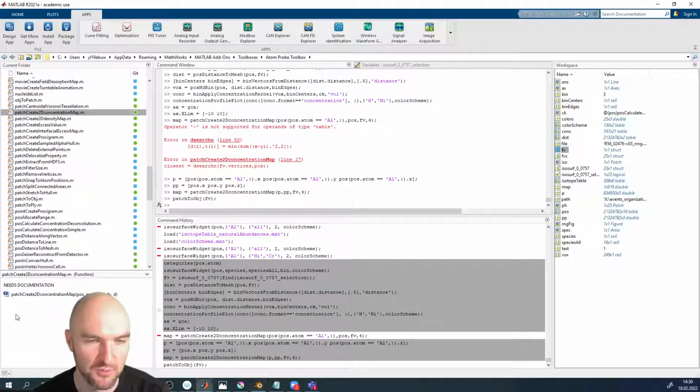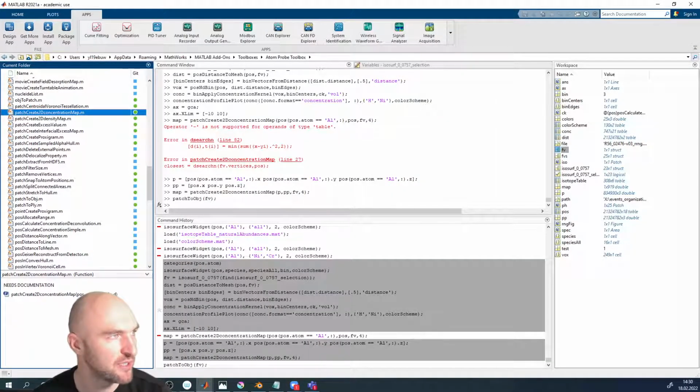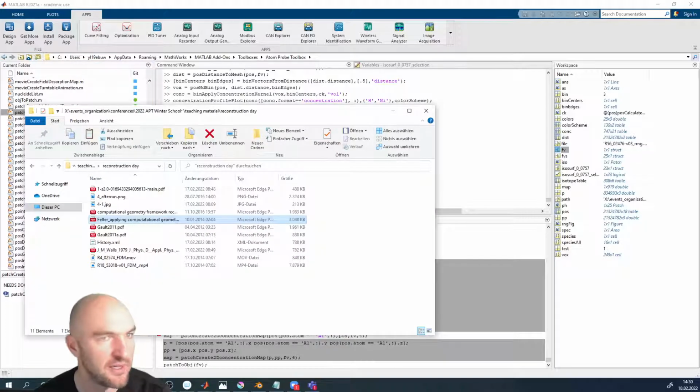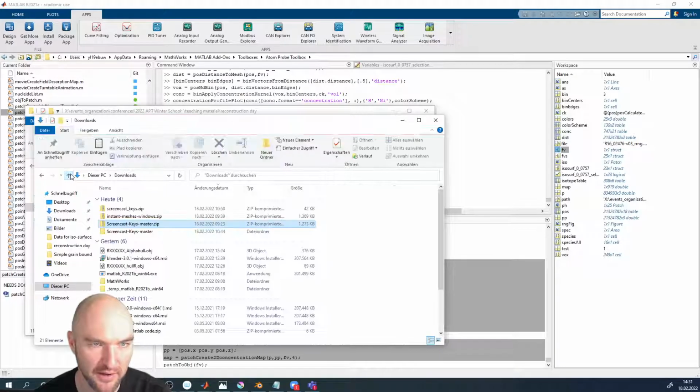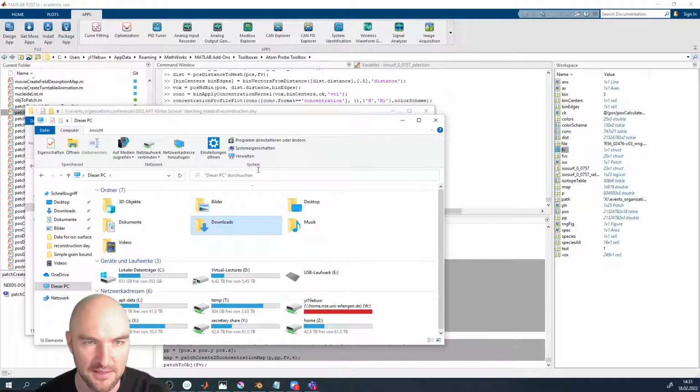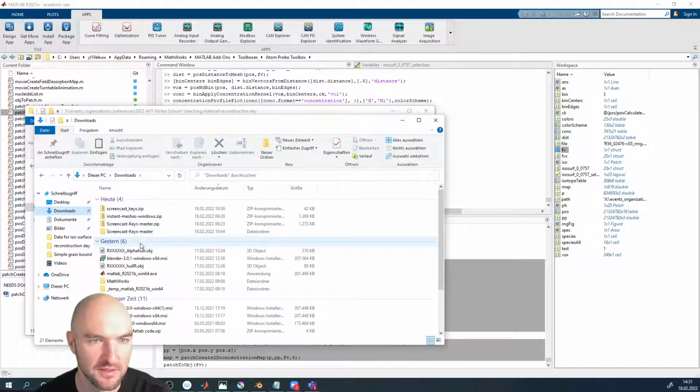Okay, so this is one option, and the last option is using a really good remeshing tool like Instant Meshes that we've shown before, and I hope for once it's not going to die on me. No, that's not what I wanted. Where did the Instant Meshes go?